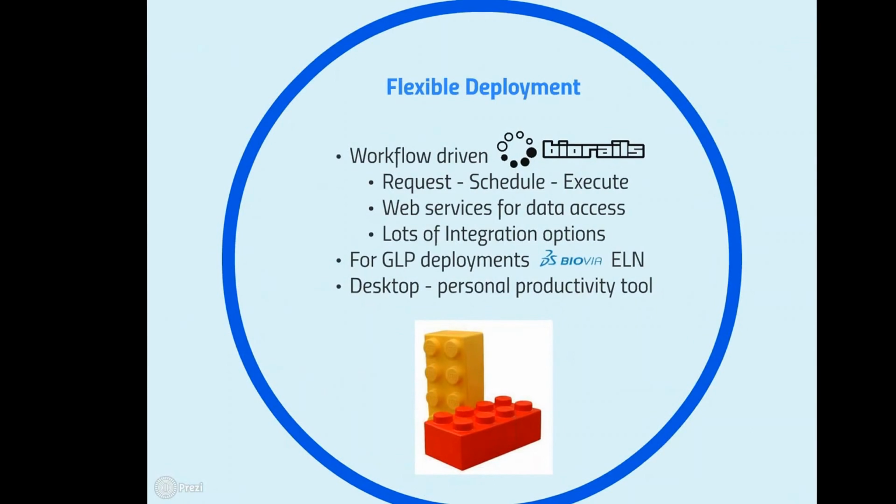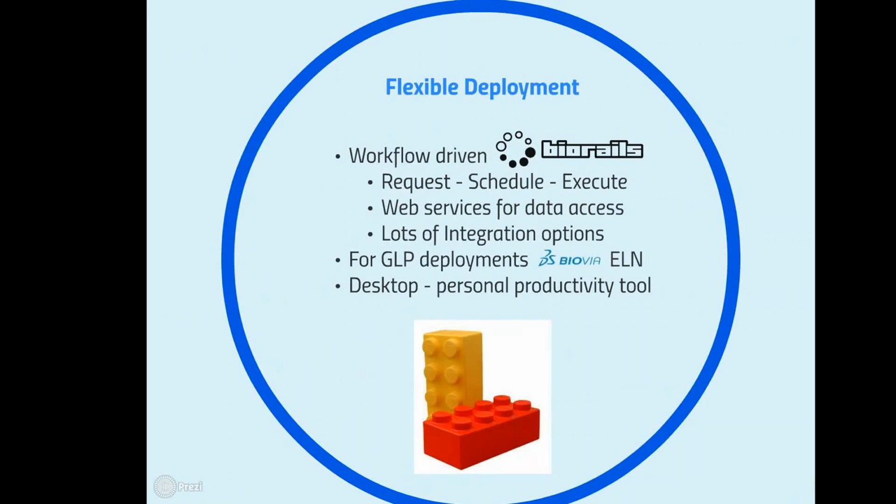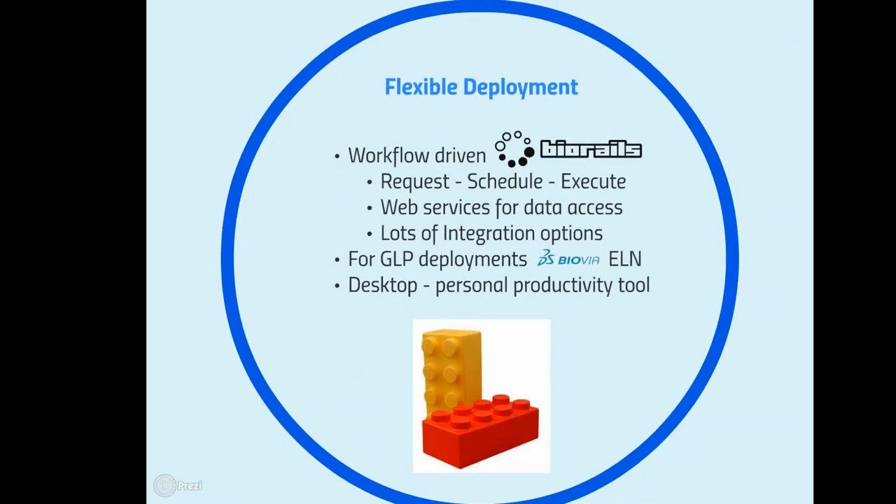This same data analytics environment is provided into a number of different enterprise platforms. First of all, there's our own BioRails enterprise platform that provides you with support for the full request, schedule, and execution workflow. So you can request assays, you can schedule them, you can run the assays, you can do the analytics, you can access your data either directly through third-party tools for querying or through web services for data access. So it's fully compatible with all modern reporting tools. It provides lots of integration options.